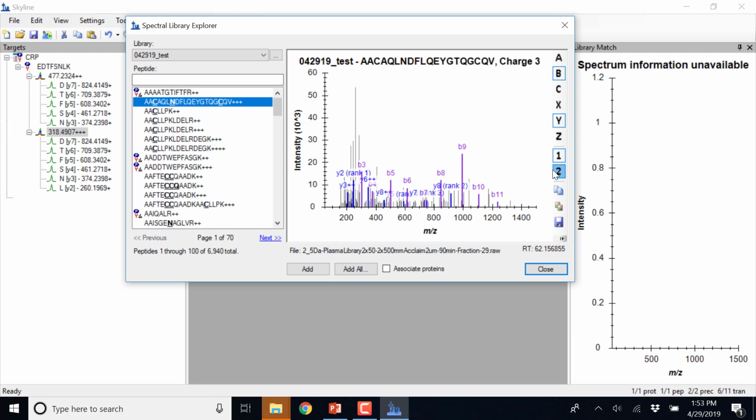These are all valid. There are general rules of thumb about why people picked Y product ions or product ions that are not loss of water, loss of ammonia. I've never really stuck to those rules. I always look at what the data tell me. If it's reproducibly generated every time and I see it every time, then even though people might think it's not stable, well, I'm going to prove that it's stable and I'll use it. Or I'll prove that it's not stable and then buy them a beer because they were right.